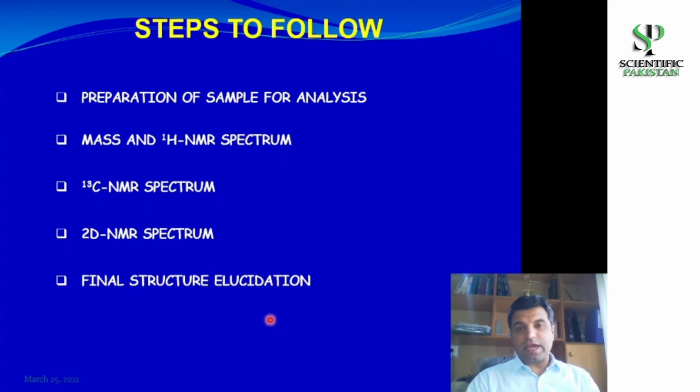So rest assured that you're going to have a very unique and interesting journey while studying NMR, because NMR is a very interesting technique and it's very close to my heart because it is interesting and at the same time very effective in structural elucidation of organic molecules.